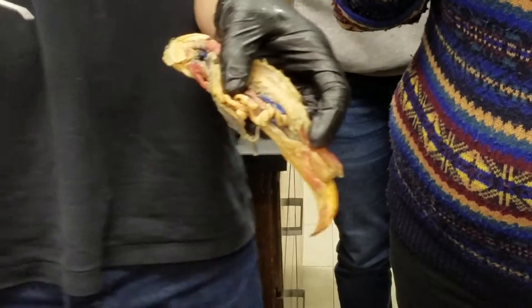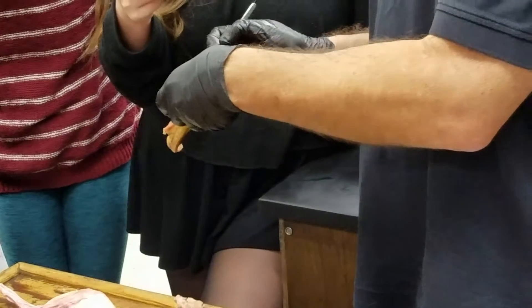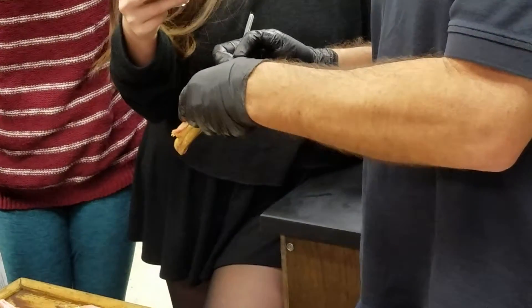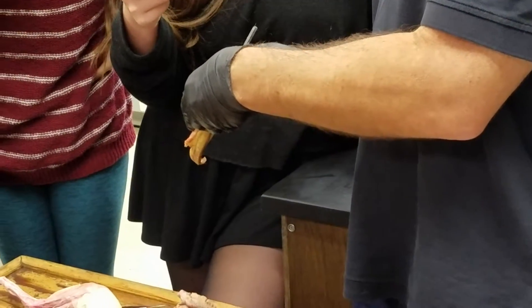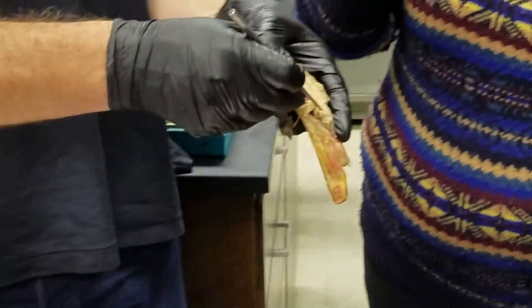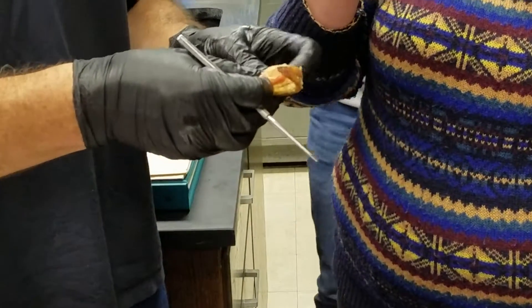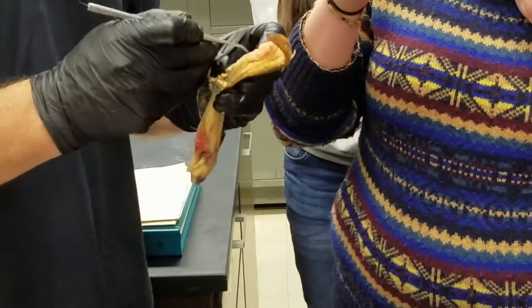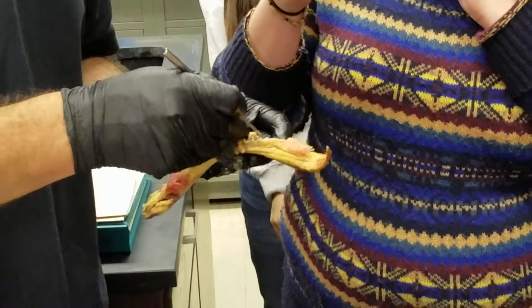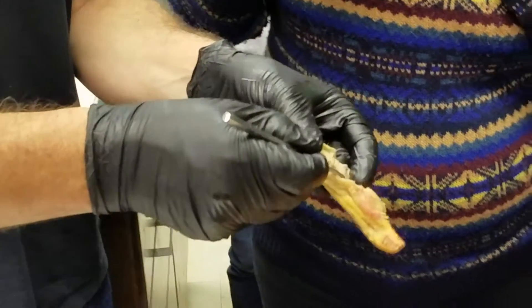There's the testis. Running alongside it, we can see this coiled tube running down, and that would be the arcanephric duct. If we look down towards the caudal end of the arcanephric duct, you can see the tissue that lies medial to it.